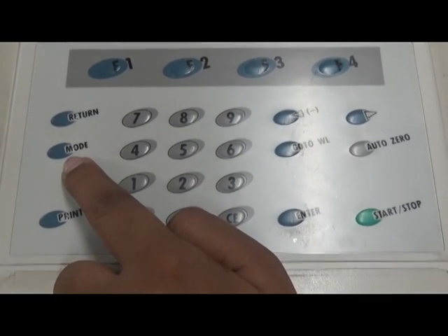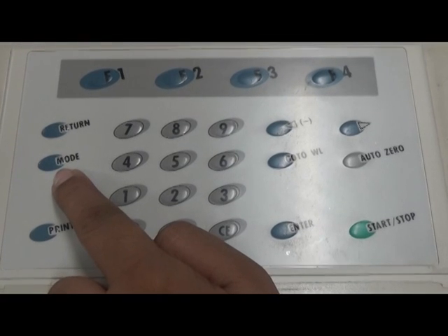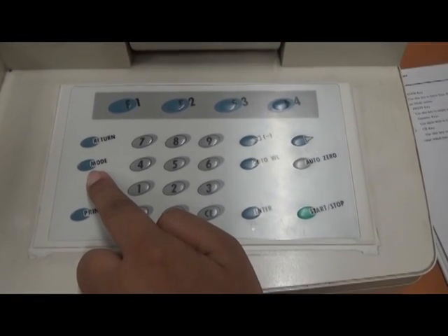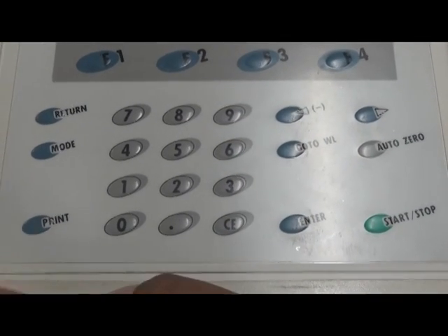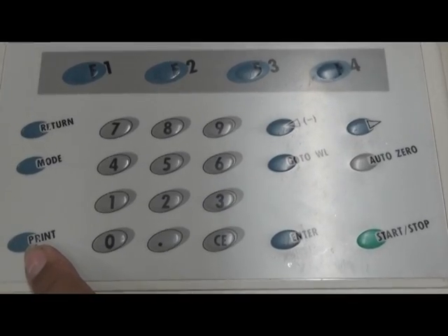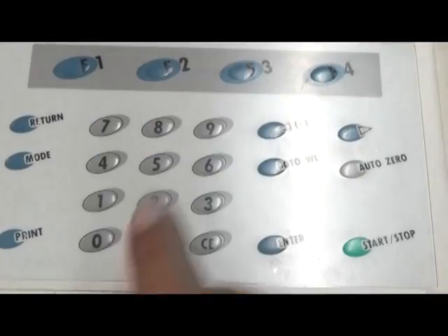This is called the mode key. Use this key to move from the parameter setting screen in each measurement mode to the main screen mode. This is called the print key. Use this key to output a hard copy of the monitor screen.